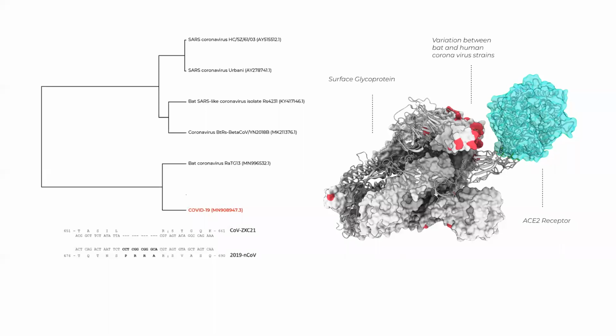So anyways, today we're going to be continuing to speak about variations in sequences that we can find by analyzing data. In our next session, which is going to be on Friday, March 27th, we'll start exploring the way that sequence changes are affecting protein structure and function.